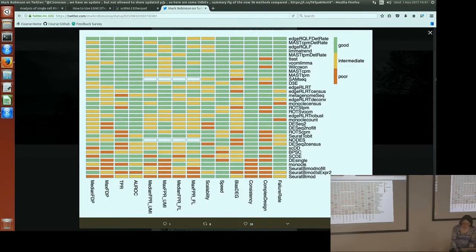is a recent comparison that's unpublished of different differential expression methods on single-cell RNA-seq data. So Nodes is another one that's been specifically designed for single-cell RNA-seq. Same with scDD. However, we've also found that scDD performs terribly and takes forever to run, which is why we didn't even bother mentioning it. Nodes is essentially a combination of a unique normalization method and the Wilcox test.